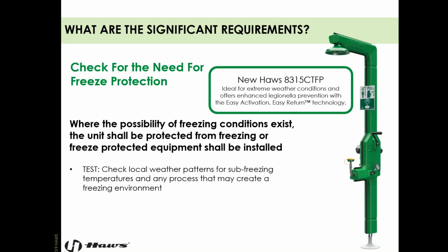Very important. Check the need for freeze protection. So if you have freezing temperatures at certain points of the year, you have to have freeze protected equipment in place. Once it freezes, obviously it's not going to activate, and it's going to create a pretty dangerous situation for your employees.